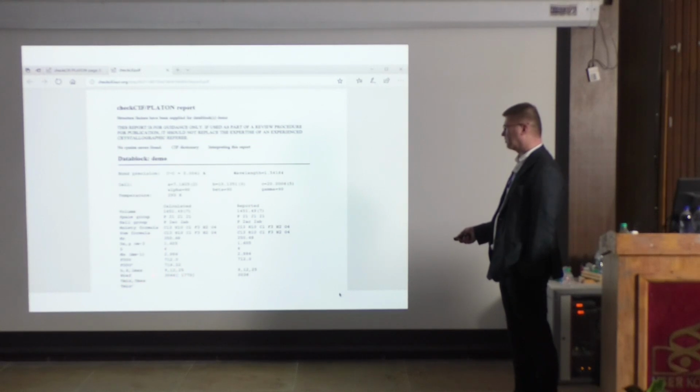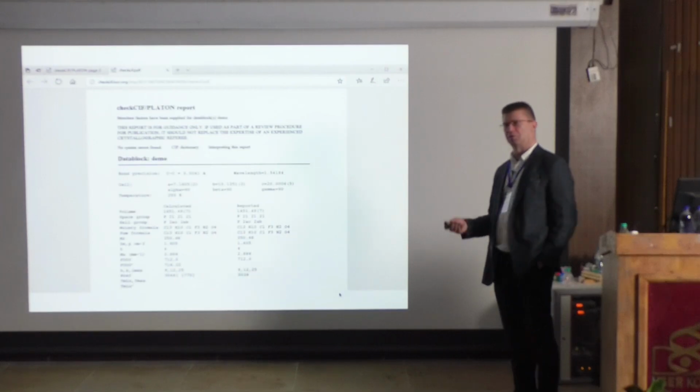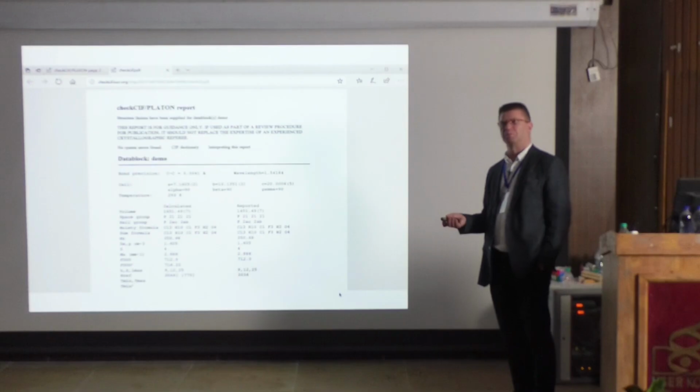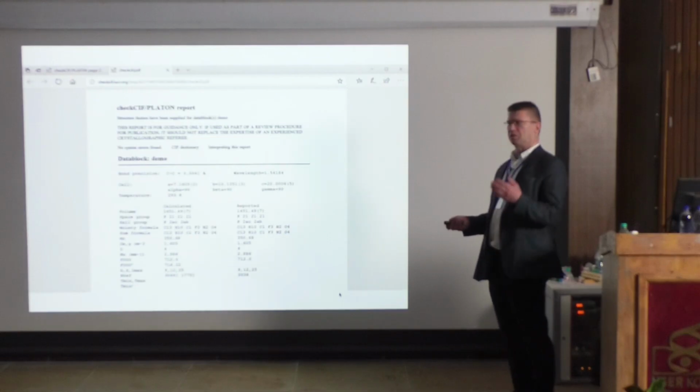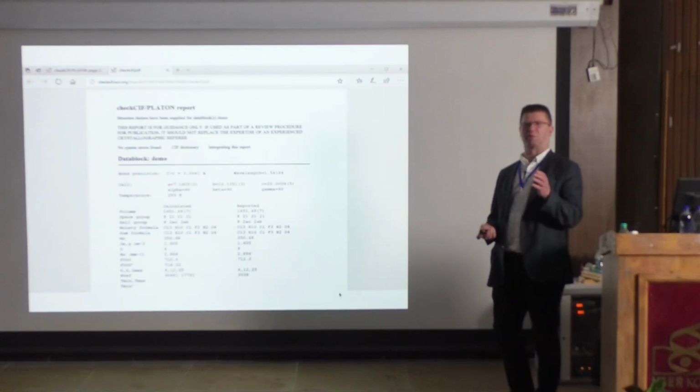This is mean, okay, and the number of reflections calculated is 3044, and we have collected 3036. So there are actually 8 reflections missing. And 8 out of 3000 is nothing, and quite probably this is a technical issue from the instrument.